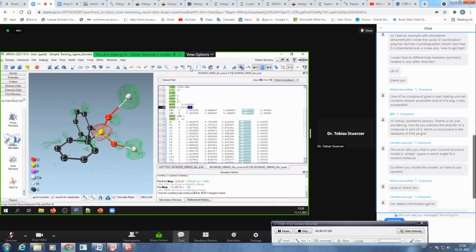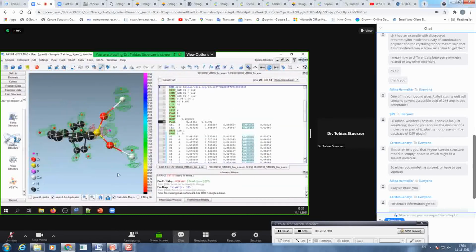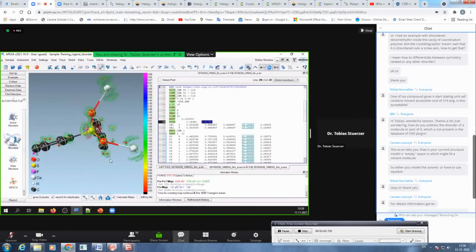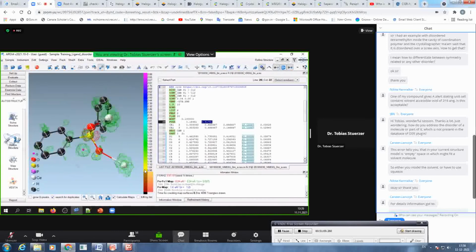And now we refine it isotropically. Looks good, so nothing exploded. Occupancy refines to 90%, so there's not a lot of disorder, but a little bit. And nicely pronounced, there are now also these additional Q peaks. With this here, you can add a Q peak filter.